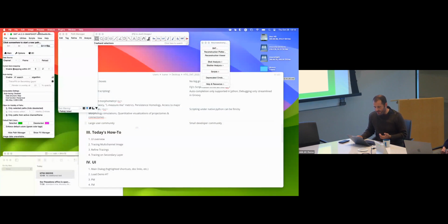I'll show you these because if you are doing something for Fiji, please use this, because it is true, Fiji is very 80s. So we can bring it to the 90s maybe. So what we are using, it's written in Swing, the GUI, but there is a library out there. Swing is still a thing right now.